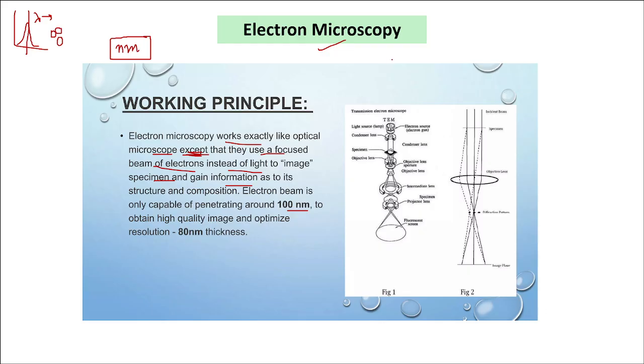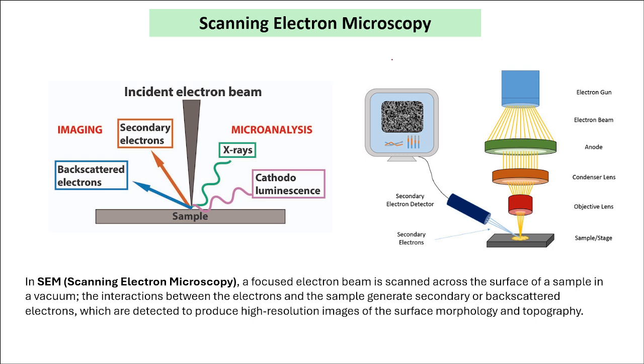So this is, I would say, the layman language for explaining what exactly is electron microscopy. Now, there are two different techniques which are mostly used when we talk about electron microscopy, and the first one is scanning electron microscopy, right? Now, what happens in scanning electron microscopy? So, this is your sample. This is the stage, and then you put your sample here.